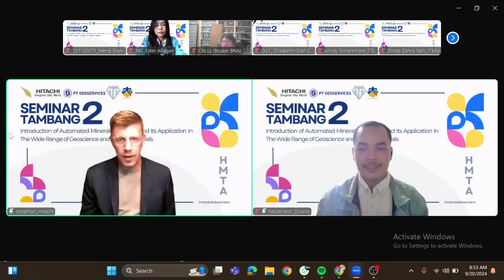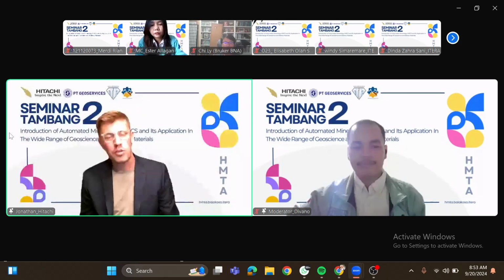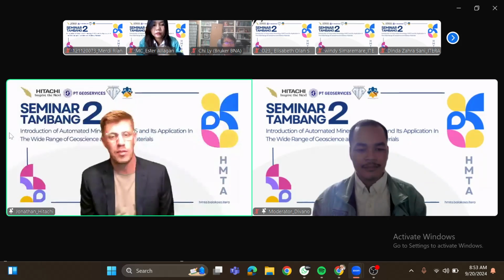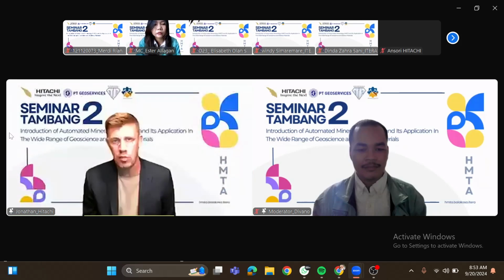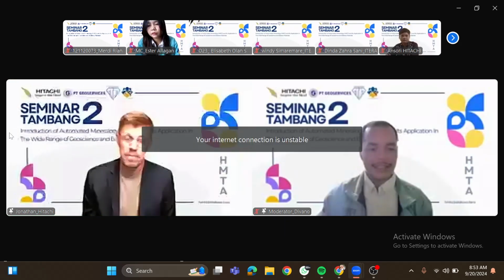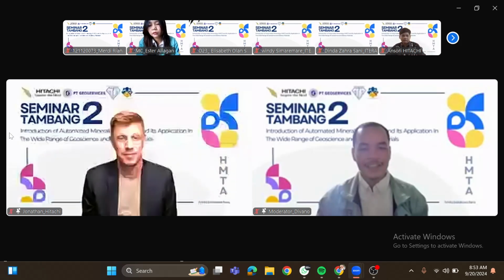So if no one's going to raise their hand to start, I'll start off by asking Chi a question. So Chi, you showed some examples of very fine rocks that you called mud rocks. Can you put some context of what that would mean for looking at something like a nickel laterite in an SEM? In fact, I ran a huge project during the nickel boom, looking exactly at nickel laterites.